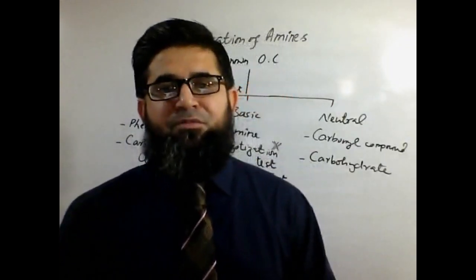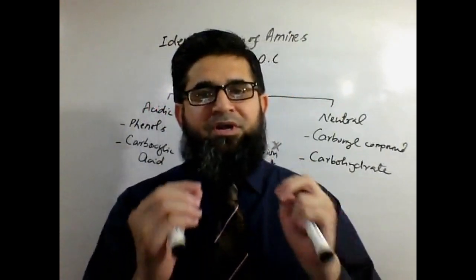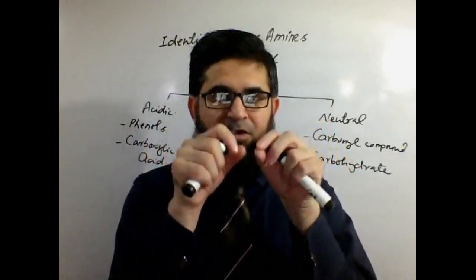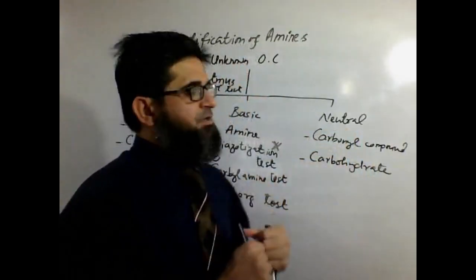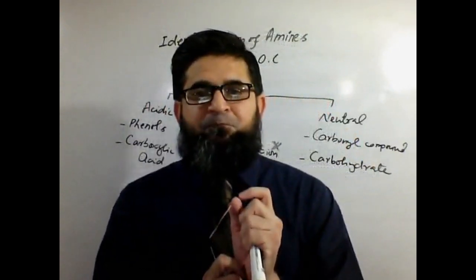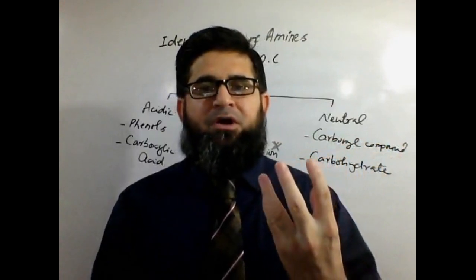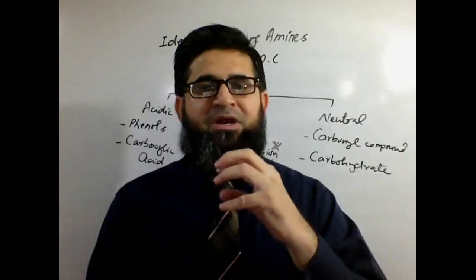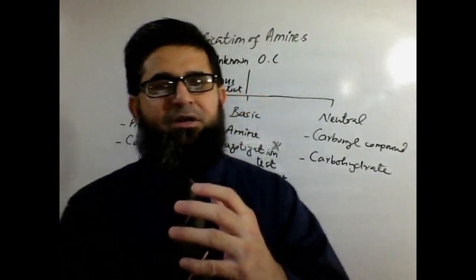So today I'm going to explain the chemistry of the carbylamine test: what happens inside the flask when you mix your given amine with the reagents of this specific test, and the evolution of a foul, obnoxious smell that confirms the amine is present in the starting compound.